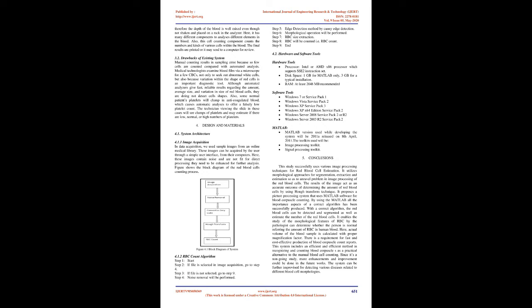At this stage, clump cells which are commonly found in microscopy need to be further separated. The watershed segmentation algorithm is then implemented to get clearer boundaries among clump cells. This algorithm will perform tasks to determine the gradient magnitude, foreground markers, and background markers. This algorithm is terminated by determination of watershed ridge lines. Region of interest, ROI, is employed for determination of which groups of blood cells can be separated. The adjoining RBCs can be recognized by determining the morphological properties of all related cells. The separation can then be based on the parameter of the cell's diameter.